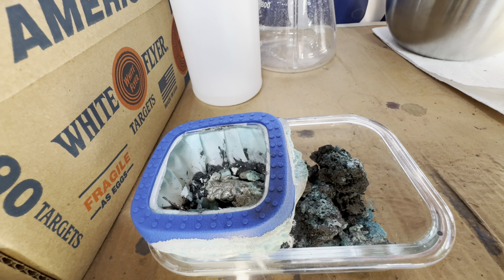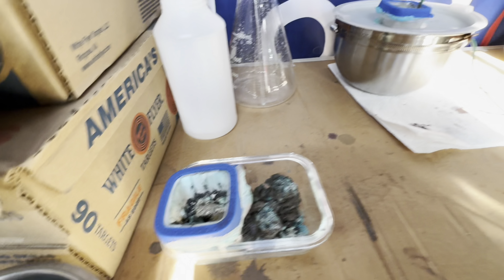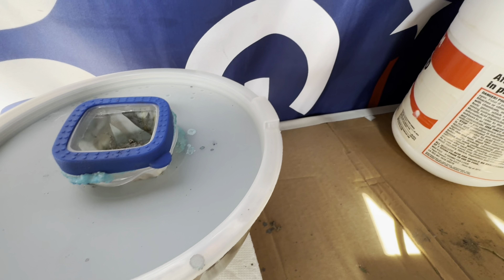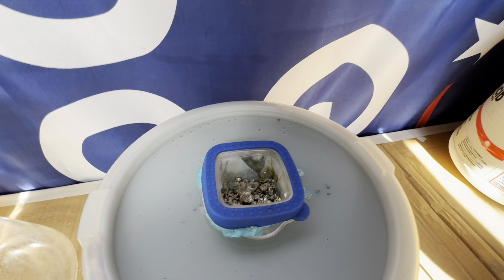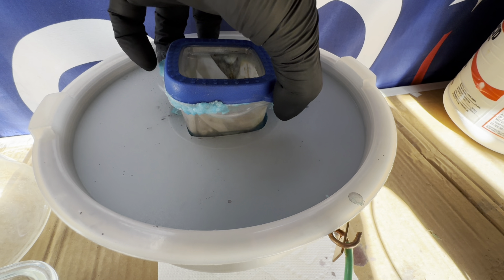I've been running for nine days now. I'm harvesting a full day early. There are some slimes and waste from my last silver run, and I'm going to be doing some refining on that. My 5,000 milliliter beaker broke, so that's why I am limited on glassware.